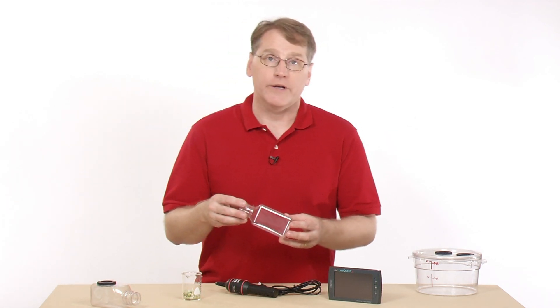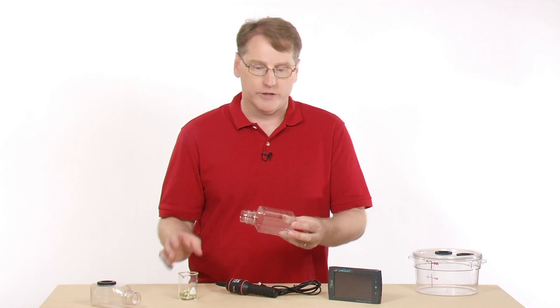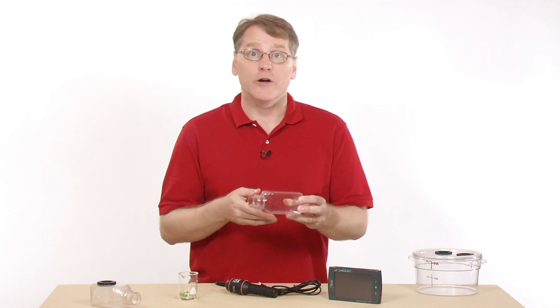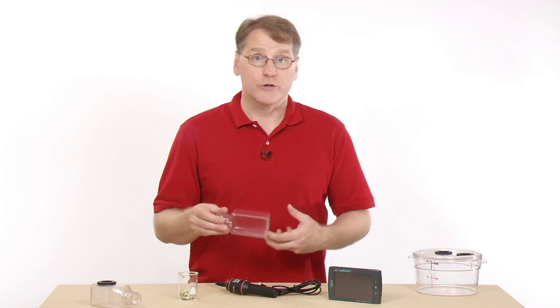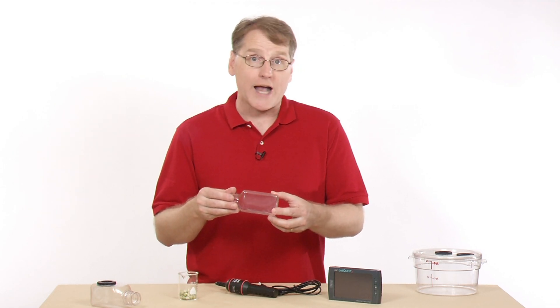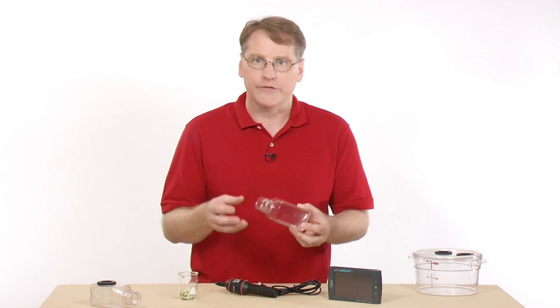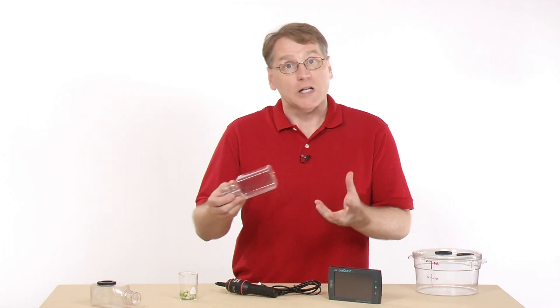You might use this with labs like the Respiration of Peas. You could also put some crickets or worms in there and look at their respiration rate, or use it for fermentation of yeast where you're producing CO2. Any chemical reactions or processes that generate CO2 gas are good candidates for this device.